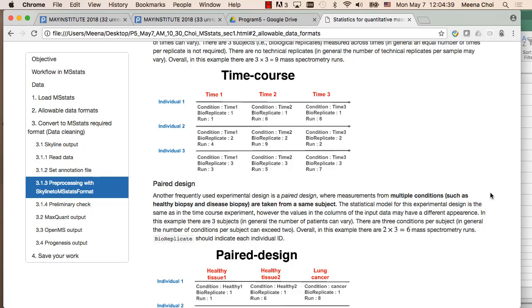So this is the key one. The reason why I ask is that people are quite confused about biological replicate and technical replicate. They assign biological replicate 1 to 3, 1 to 3, 1 to 3. If we have any same biological replicate information, we actually make a link in MSstats or any kind of experiment design. So that is the thing.